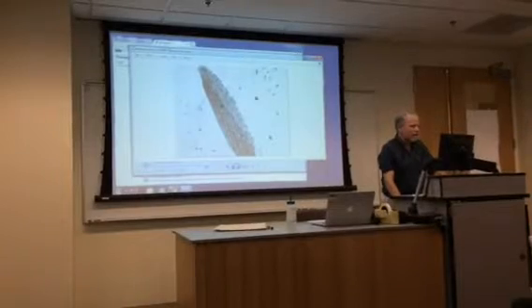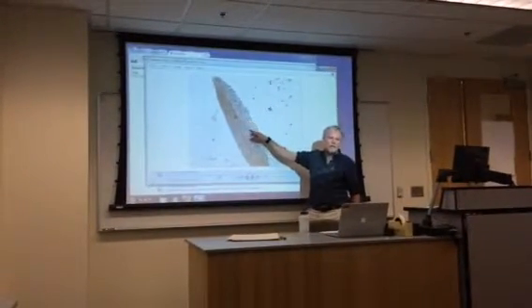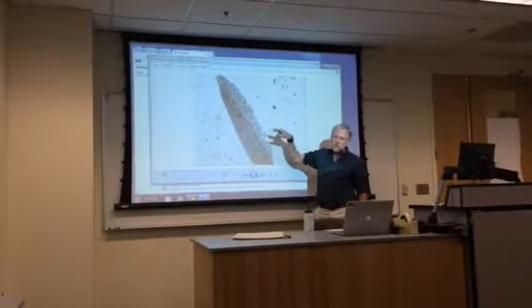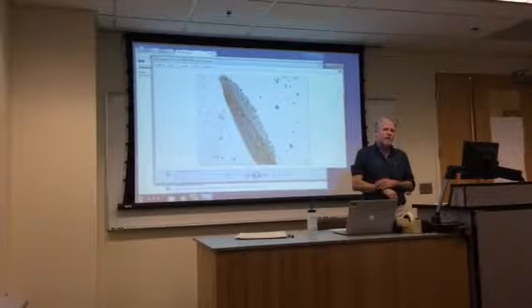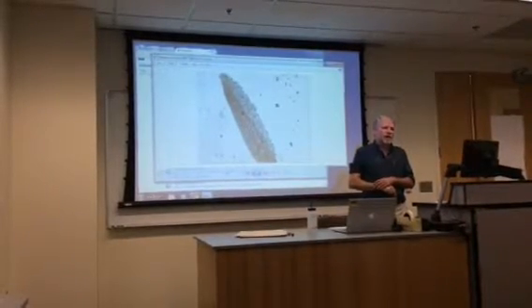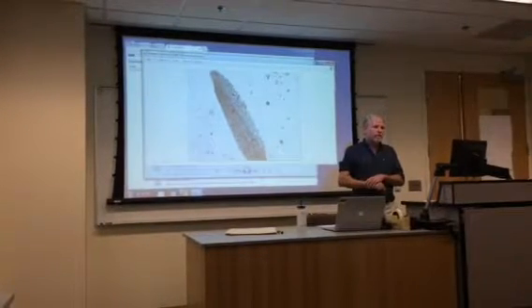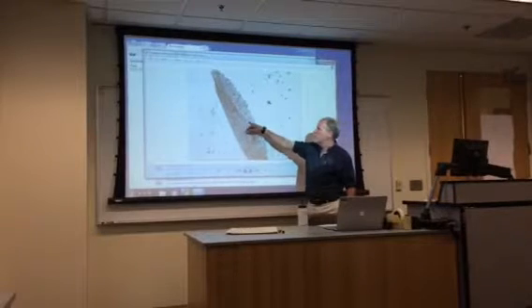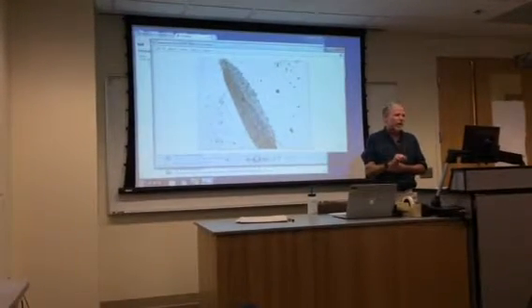All right, last couple things here. This is a sphagnum leaf. Note this reticulate pattern. It's got all these diamond cells. Most of the cells in sphagnum, the peat moss, which is a separate group, not a true moss, right? So we'll call it the peat mosses. Most of those cells are dead. When you see sphagnum, it looks yellow-green, right? There are living cells, small cells that are around these diagonal cells. They are green and photosynthetic, but most of them are clear and empty.